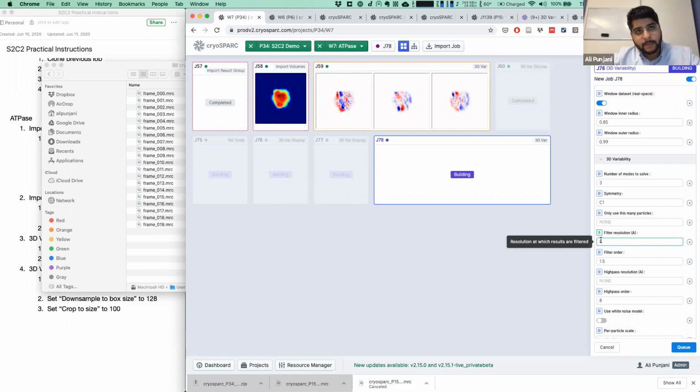That's a great question. Some of these things are still evolving topics, and we don't have, for example, something like Fourier shell correlation for 3D variability results. It's in principle maybe possible to do something like that, but some of the mathematical properties of the 3D variability analysis algorithm tell us that there aren't too many ways for the algorithm to give an incorrect result if there actually is variability present in the data.